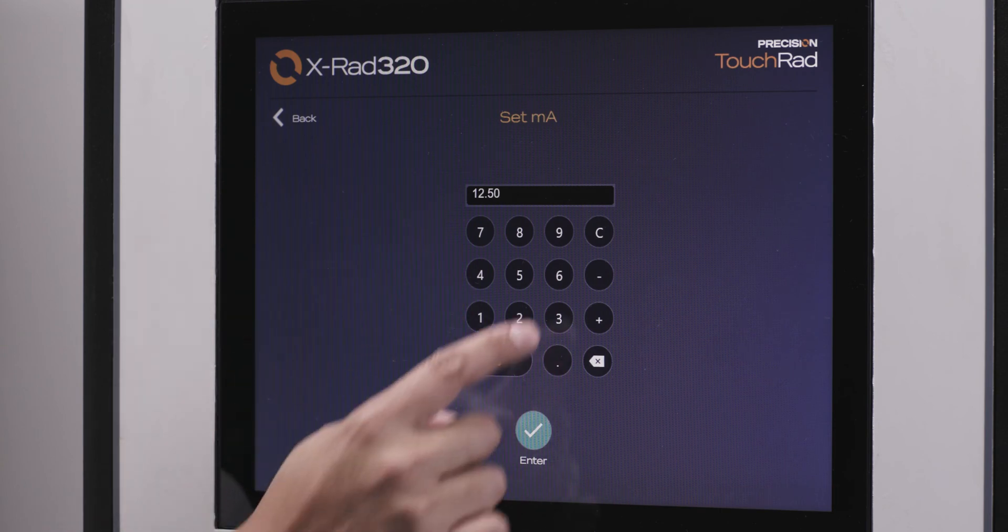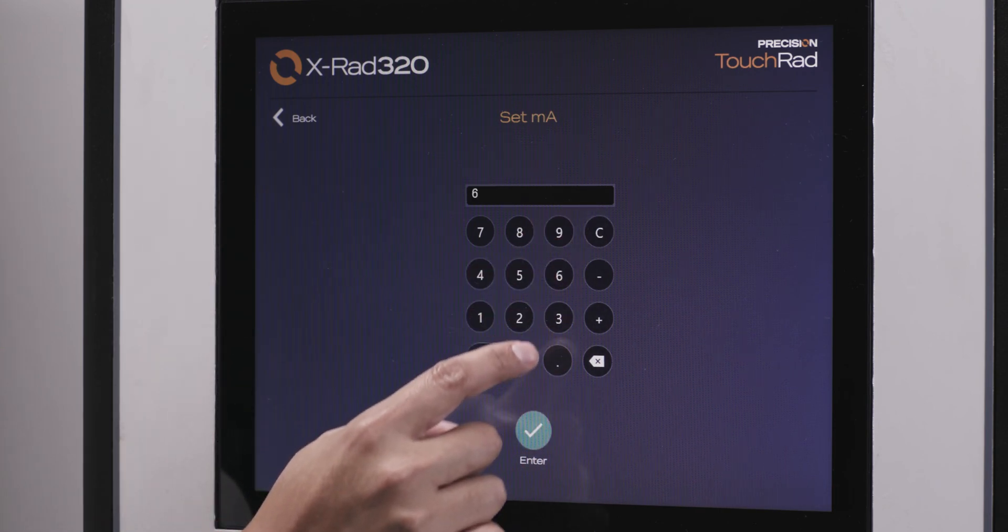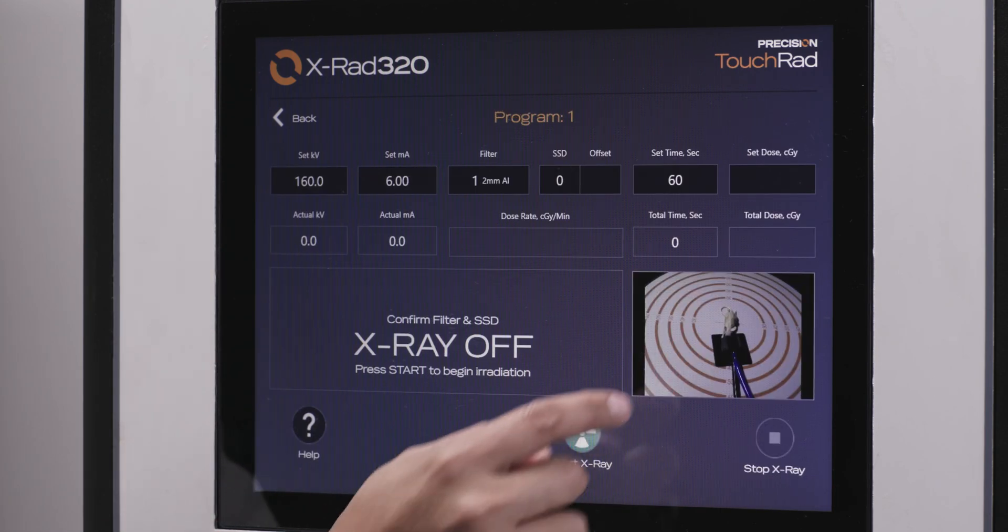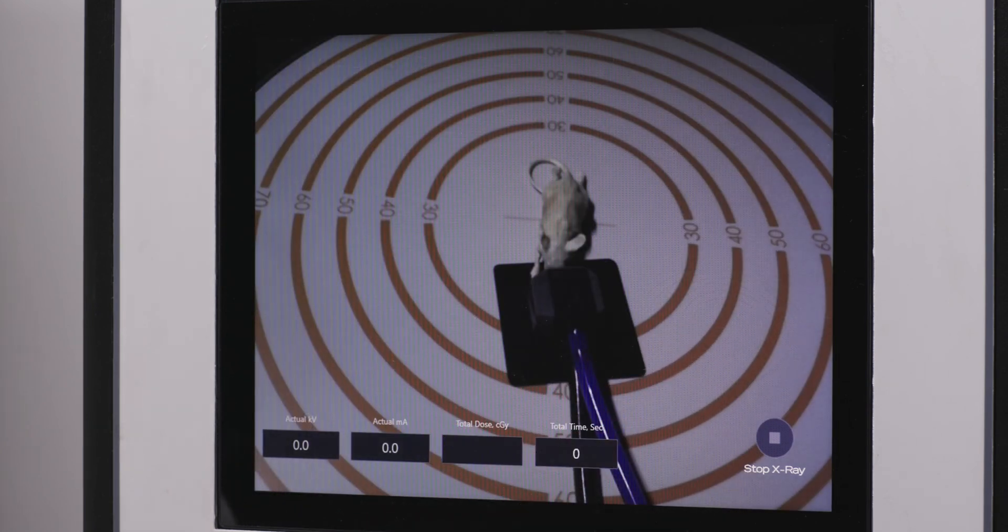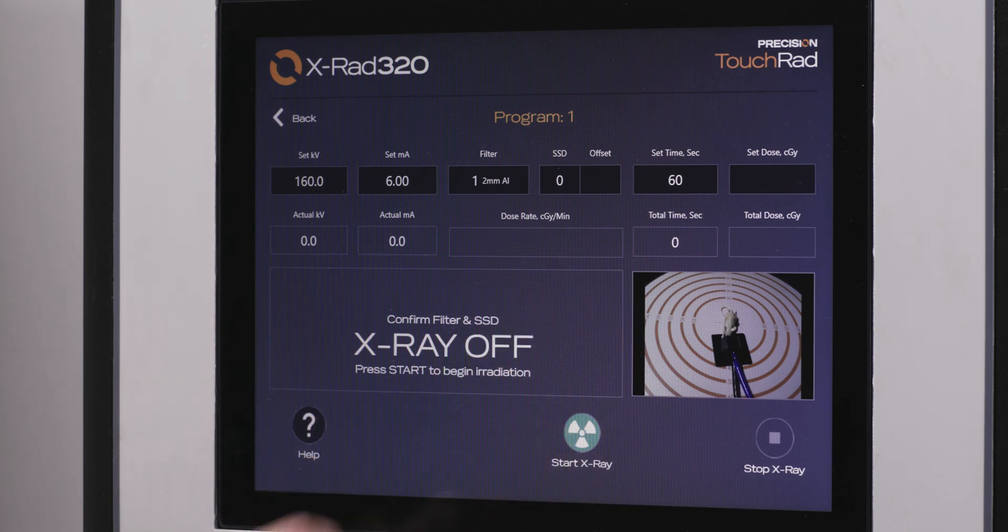Live viewing of the internal chamber with a high-resolution webcam can be seen as a small or full-screen image on the touch screen. Real-time viewing ensures proper safety of animals during treatment.